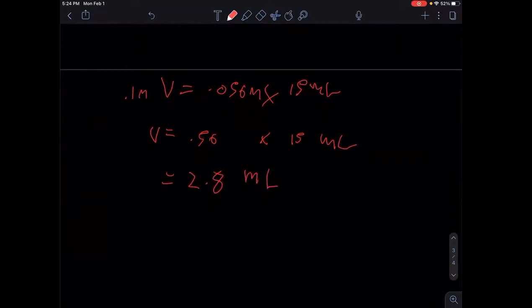Milliliters. Okay. So yeah, I guess we... This is not 15. It's supposed to be 50. 50. Okay, that makes more sense. Yes, I misheard that. Okay, there you go. That is basically for your master one. Should it be 28 mil or 2.8? 2.8. All right, 2.8 mil.